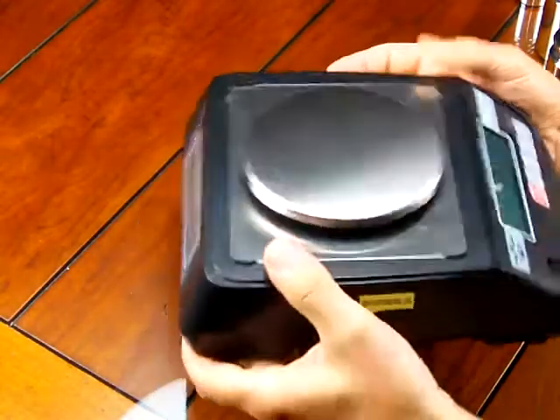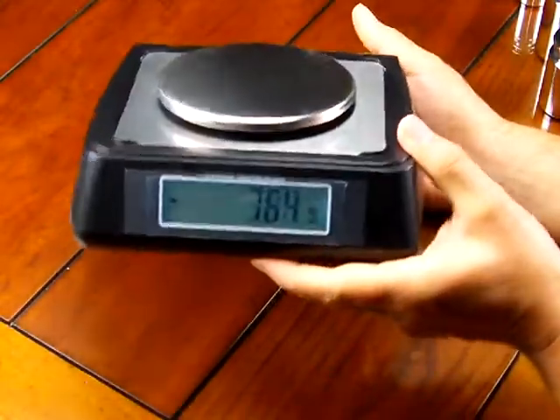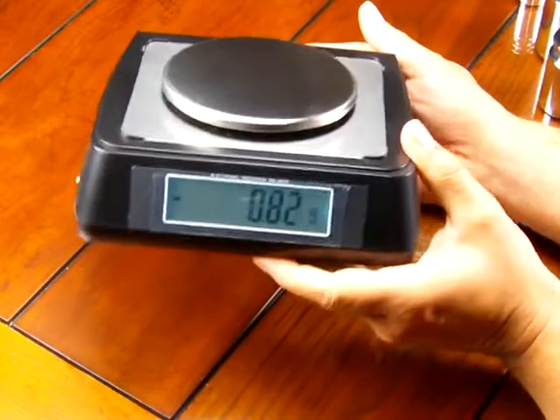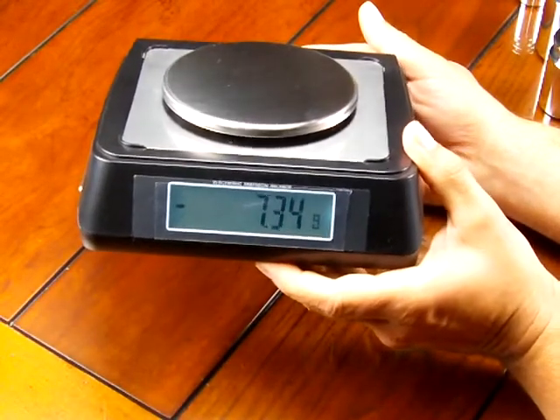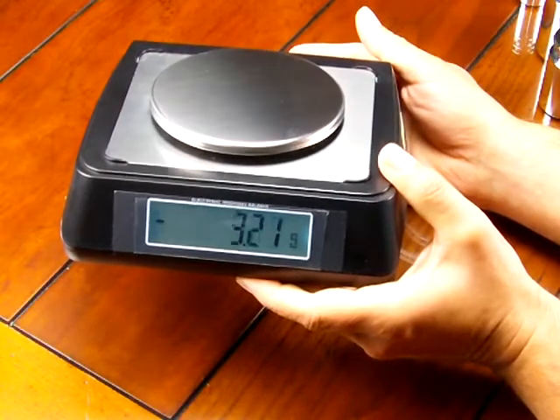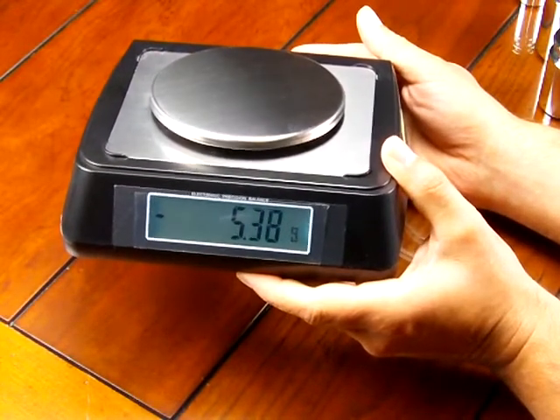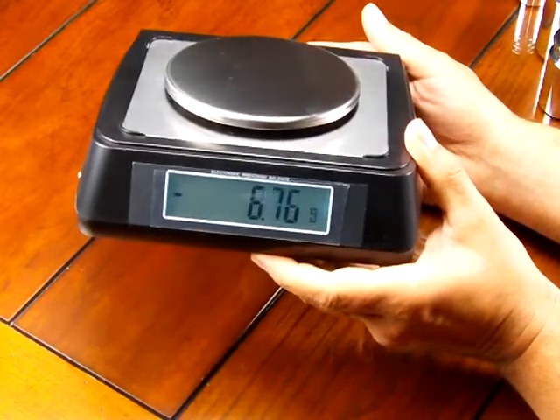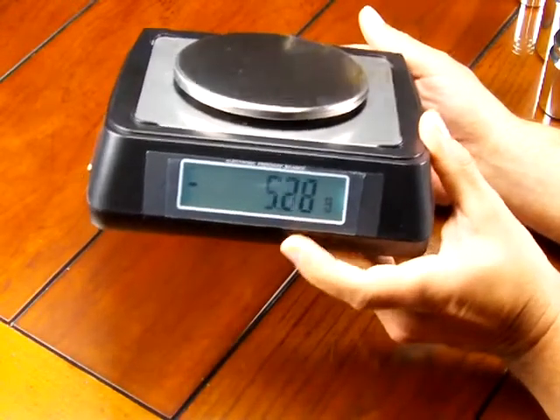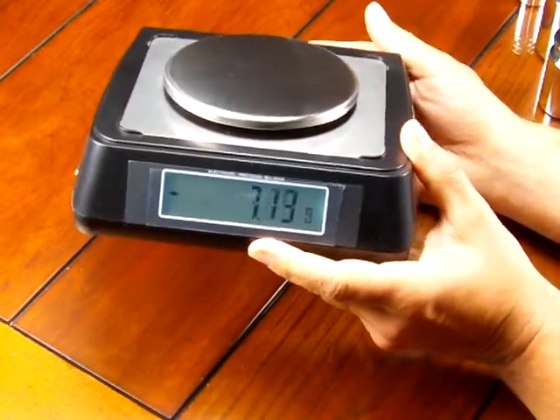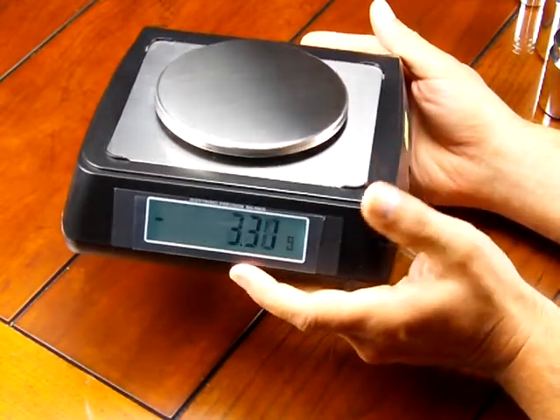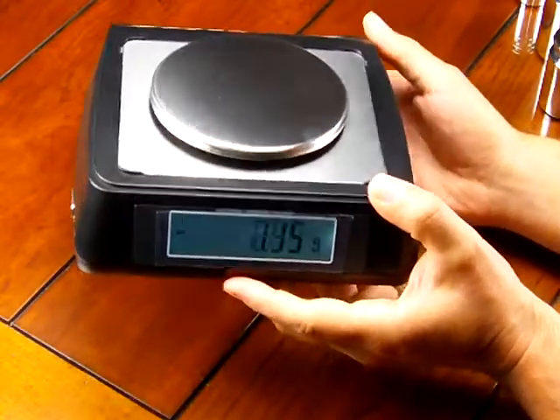Now on the back of the display, you have a dual display here. So this scale would be great for any kind of demonstration. So that the operator on the front of the scale can see what is the weight of the object, but also anybody from behind can actually see the weight. So it has two displays, which is a real unique feature for this price category for a portable top-loaded scale.